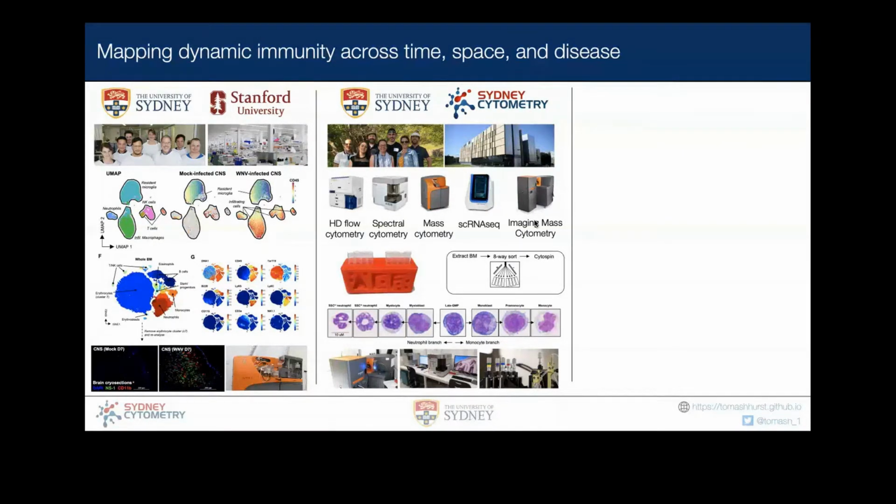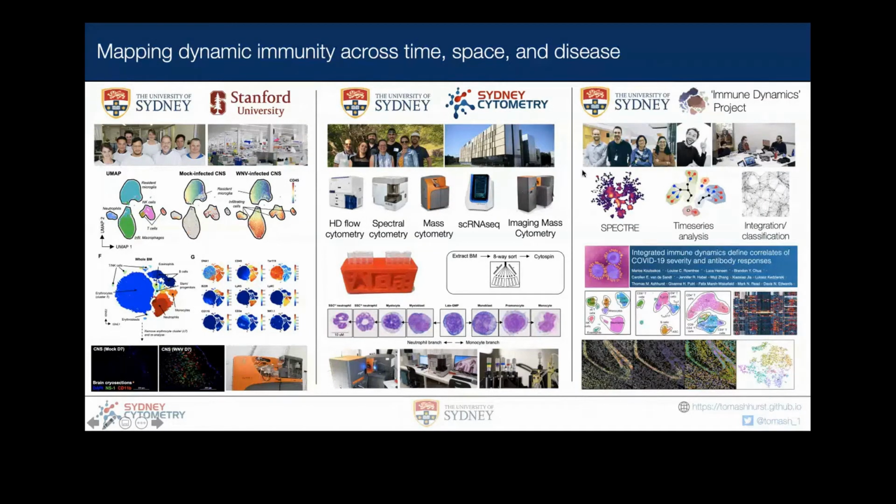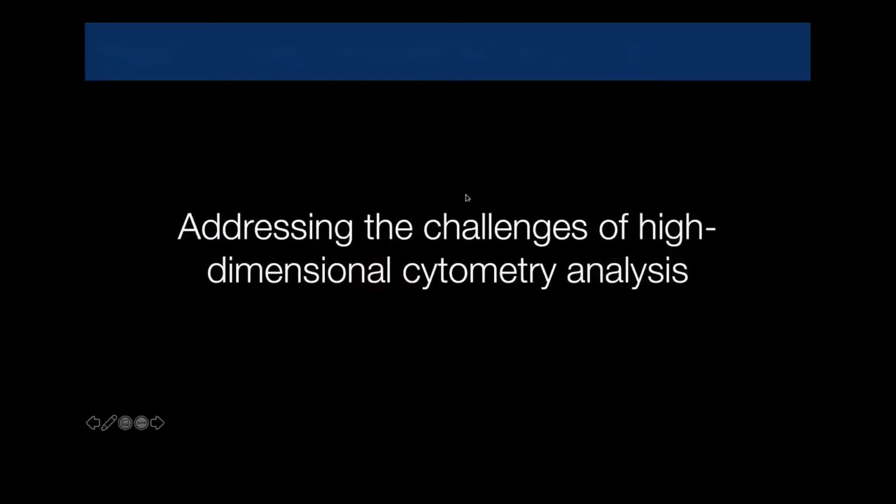In this case, this was mainly doing the analysis of the data rather than running the samples, which were run in Melbourne as part of our major wave that happened down there. But something that's become apparent throughout my journey so far is that as our technologies improve and get better and better, we can measure more things, measure more samples. What ends up happening is we end up generating these data sets, which can be really quite difficult to manage. Either because the number of things we're measuring about each cell are becoming just a little bit ridiculous, or the sheer number of cells we're analyzing becomes a bit of a problem.